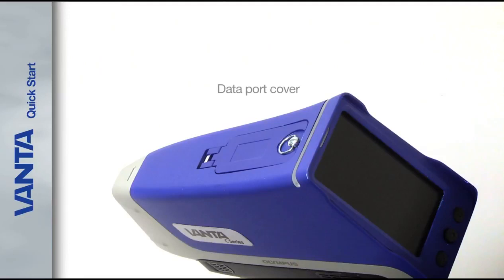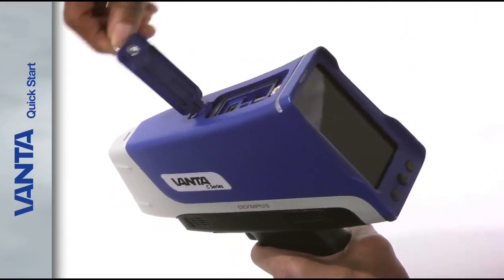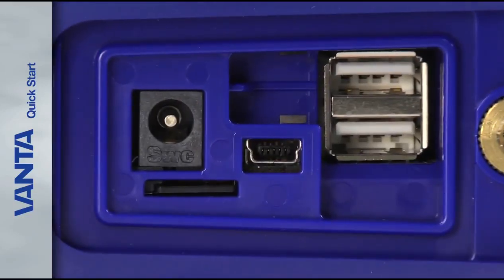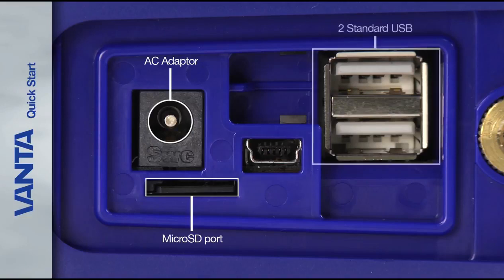On the top of the Analyzer, the data port cover protects the Vanta data ports and connections. To open the cover, lift the ring and turn it counter clockwise until the cover releases. From here you can access the Analyzer micro SD port, the AC adapter socket, two standard USB connectors, and one mini USB connector.